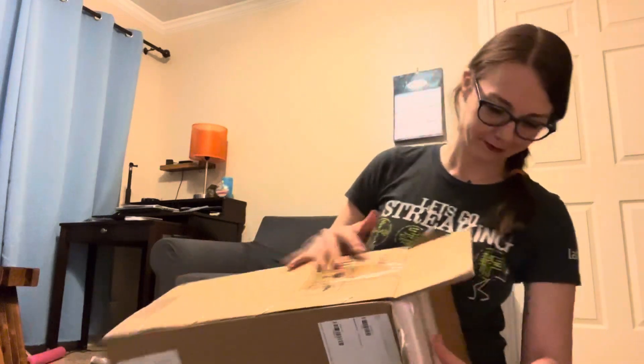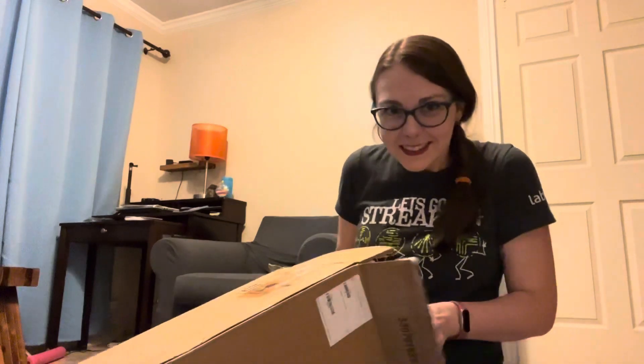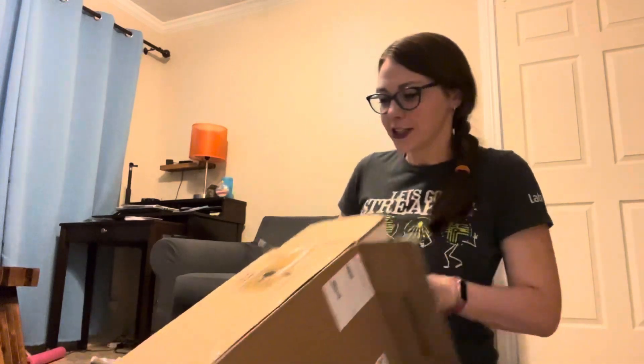Try not to break it. It's like Christmas — it's like the best Christmas ever.